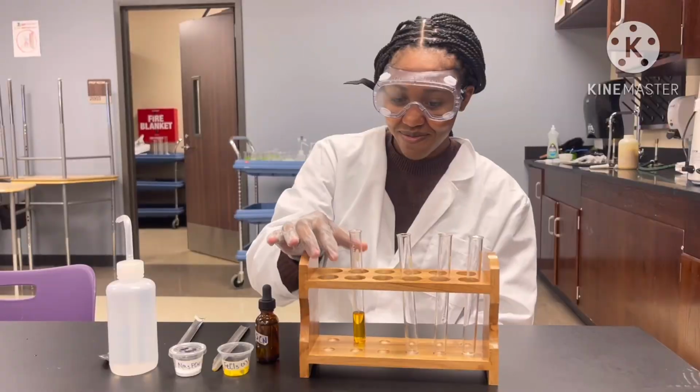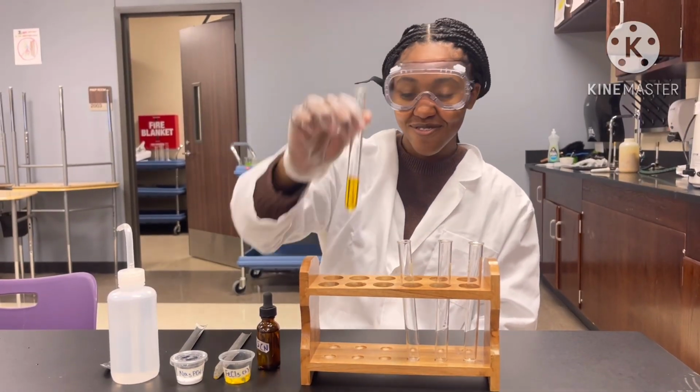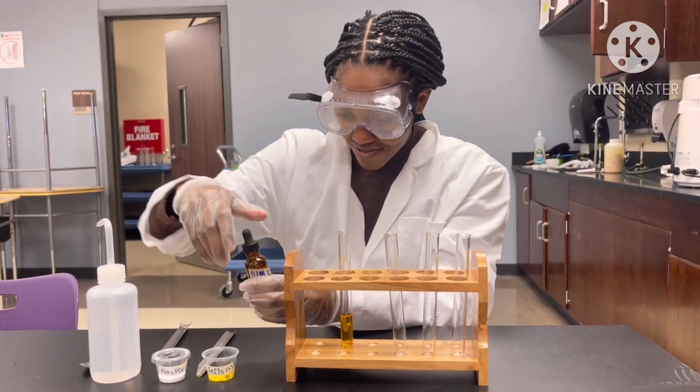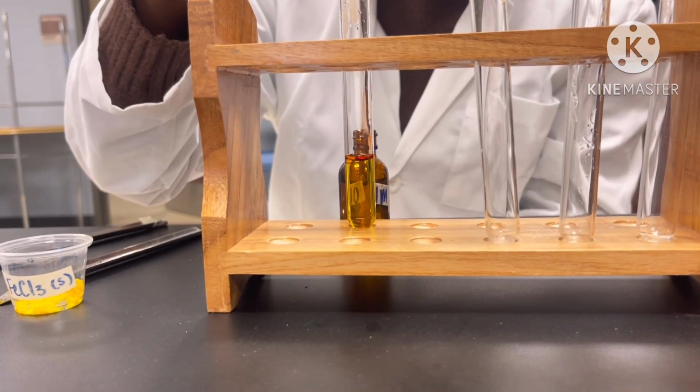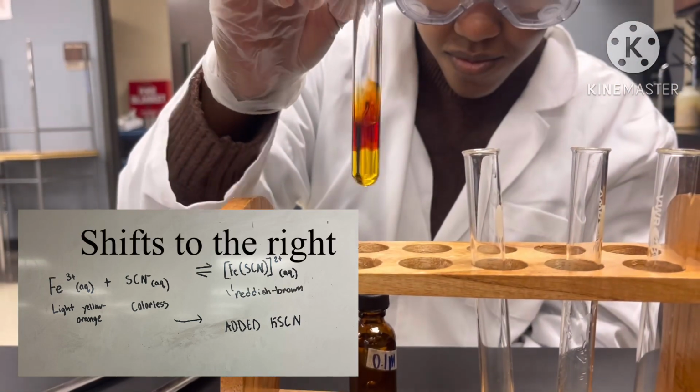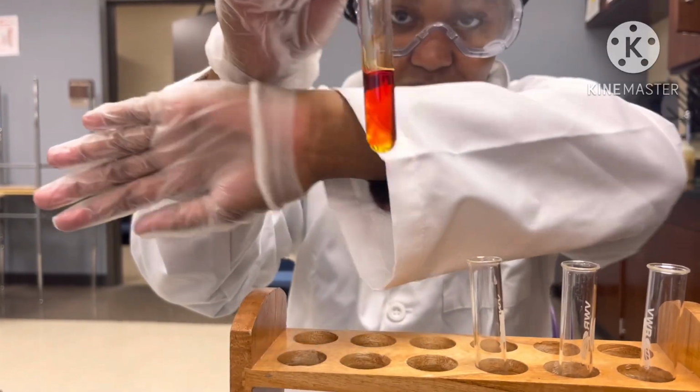the change. Here I have iron 3 nitrate in a test tube, and I will add 2 drops of potassium thiocyanate. By adding potassium thiocyanate, I'm shifting my equation to the right to make more product, which is why it makes a darker red color.